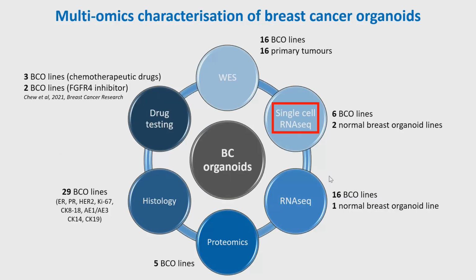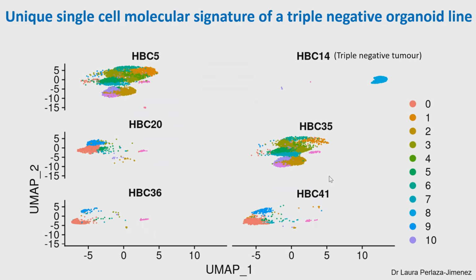I would like to now discuss our single-cell RNA-seq approach. We've done single-cell RNA sequencing across 6 breast cancer organoid lines.